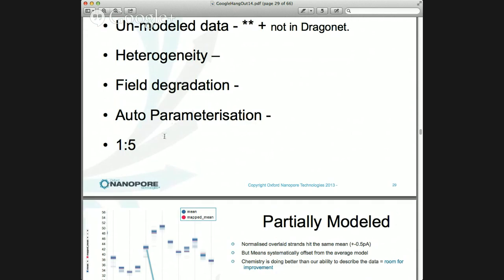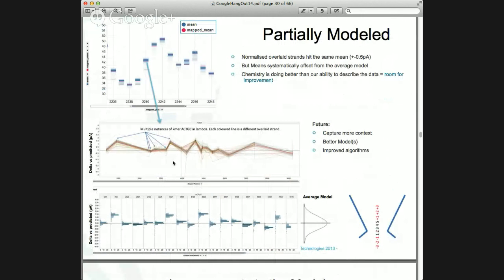And it's worth remembering that if we have a damaged base, say, or an error, it will affect about 5 bases because we're reading k-mers. Now, people have shown, and we know, that if you PCR your sample, you can reduce the error rate, probably because you're healing over damaged bases that are not yet in the model. So again, we're nowhere near a hard limit on data quality yet. I anticipate that gradually improving over time. An example here, I'm going to go really quickly, this is key.